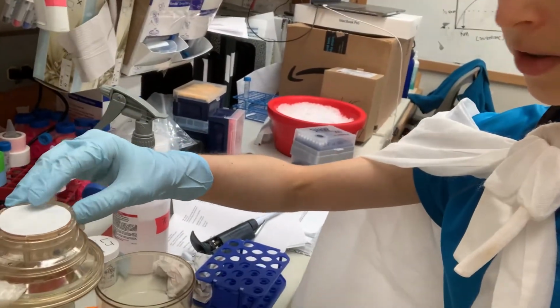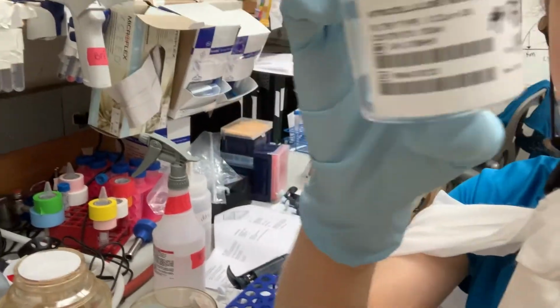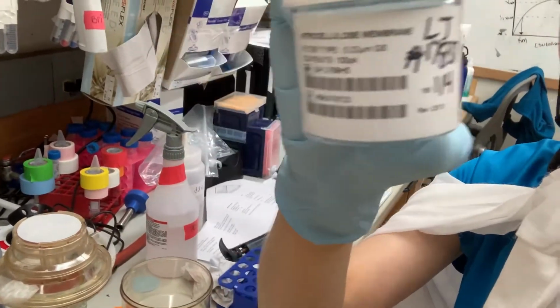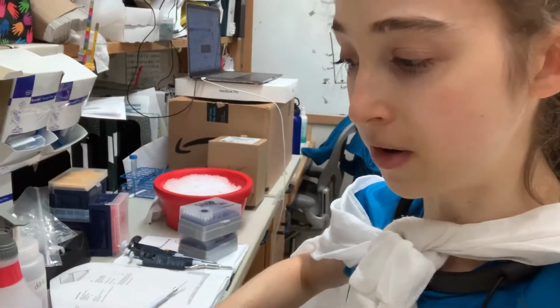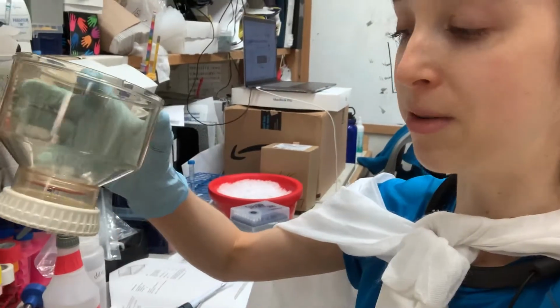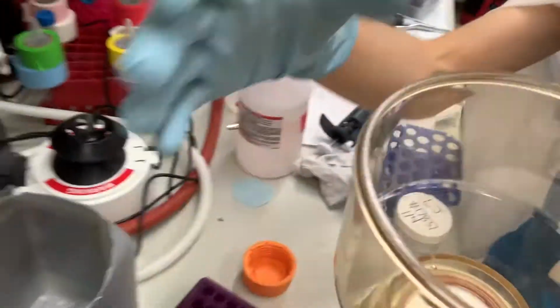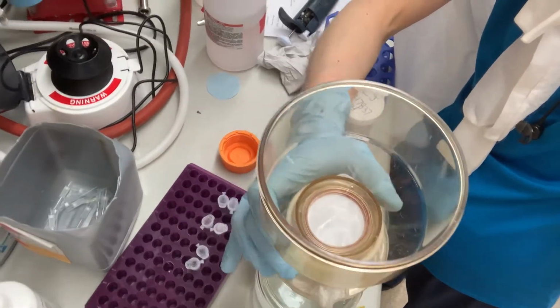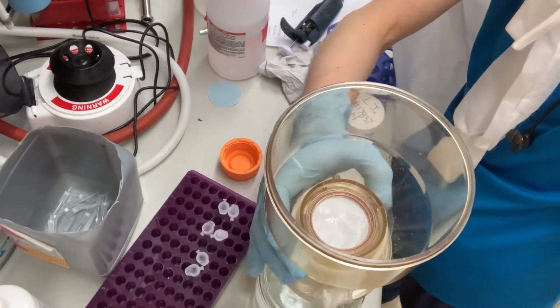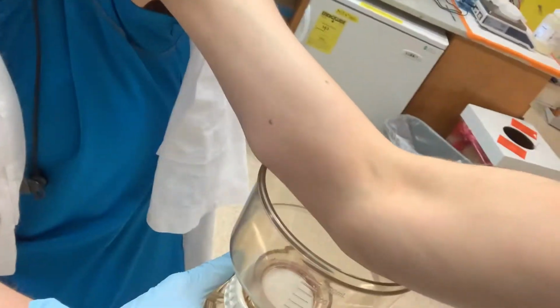And then you have to put your membrane on top. That's actually going to do the filtering. This part is single use. These are nitrocellulose membranes. These are 0.2 micromolar, or micrometer. See, I always default to molar when I see micro. Okay, but anyway. And then this base part. You want to hold down the base. This is hard to do one-handed, but you want to hold down the base before you screw it on, or else, as you see, this isn't going to be tight, even though this bottom part might be tight. You want the whole thing to be tight. Okay.